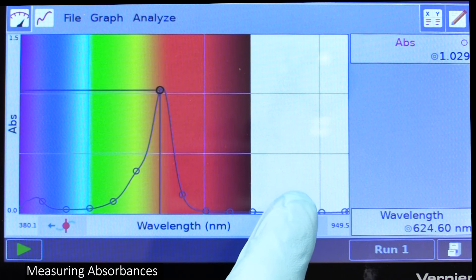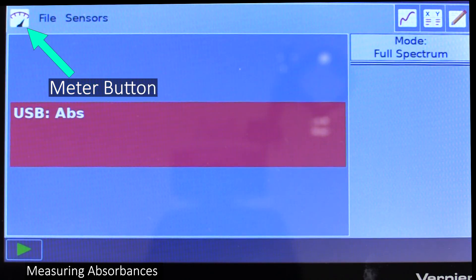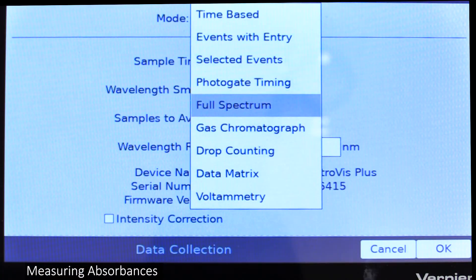What you want to do here is select the wavelength your solution absorbs best at. Once you've made your selection, click on the meter button to go back to the meter screen, then select mode and change the mode to events with entry.